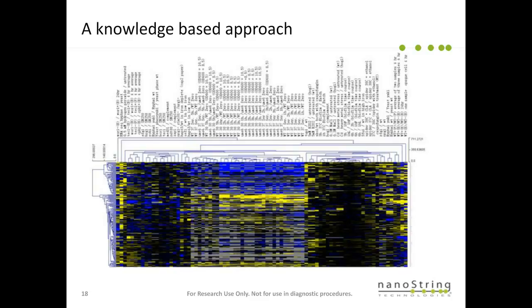So how do we come up with which genes to study? We collected all the published data sets available to date. Those data sets are mostly from microarray, and some recent ones are from RNA-seq. They include studies about zinc or iron limitation, oxidative stress, or osmotic stress, and also exposure to serum or 37 degrees, which mimics in vivo conditions.